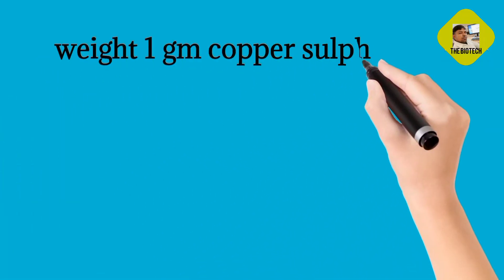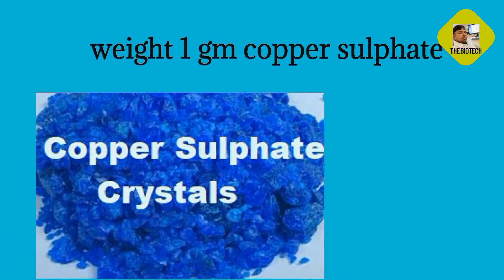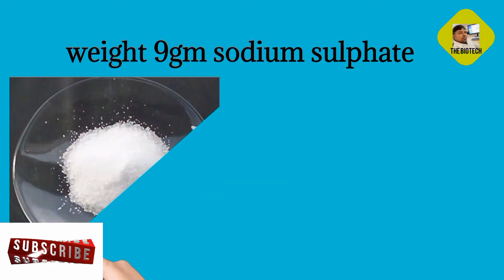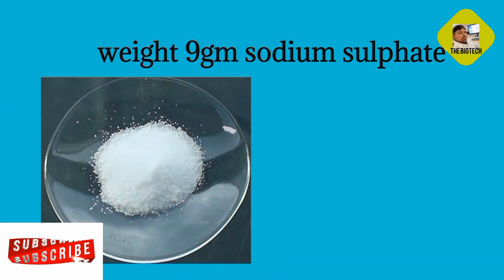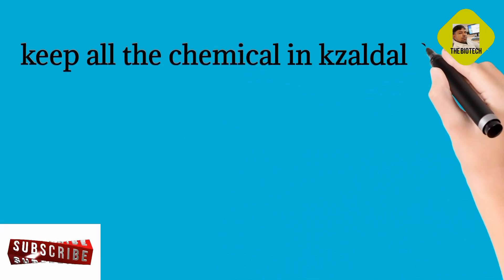Weigh 1 gram Copper Sulphate and 9 gram Sodium Sulphate. Keep all the chemicals in the Kjeldahl Flask.